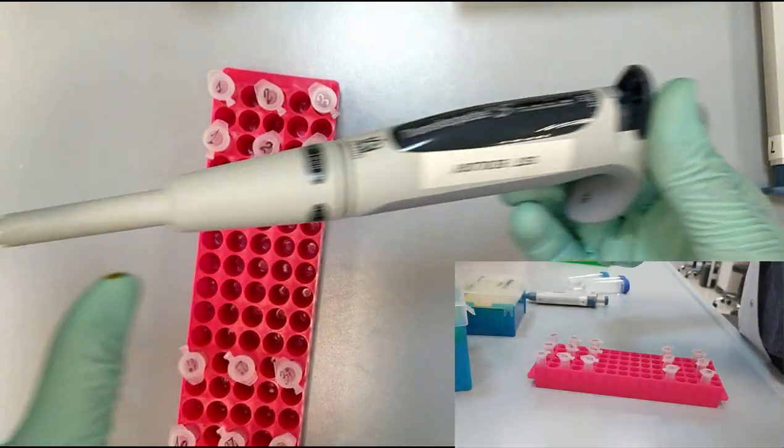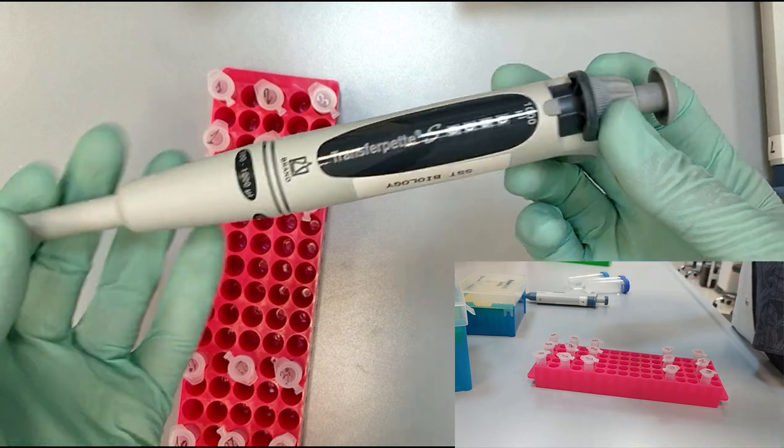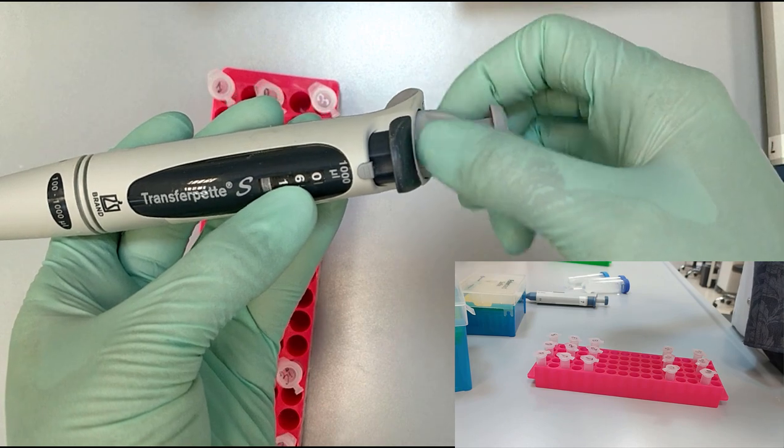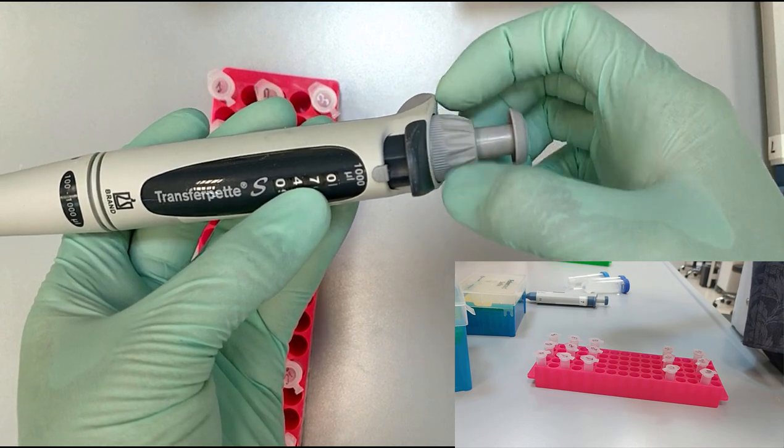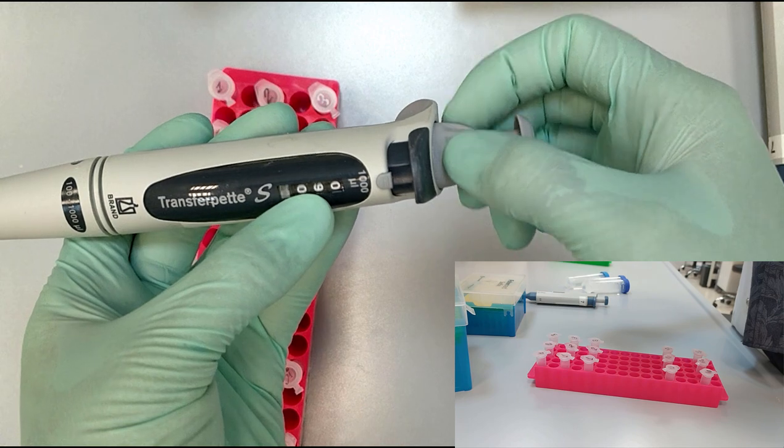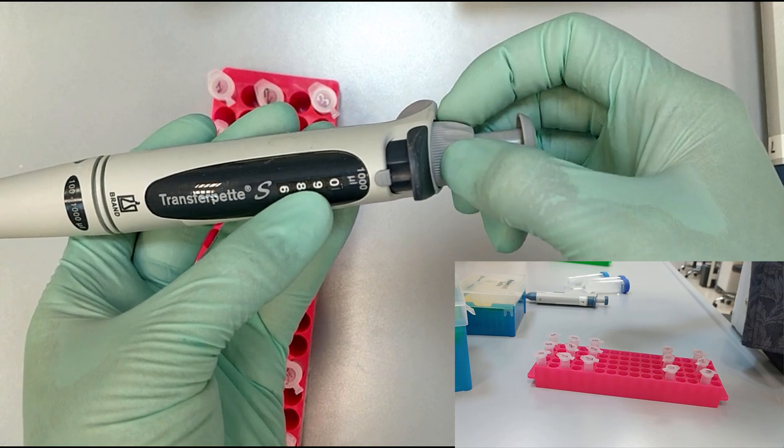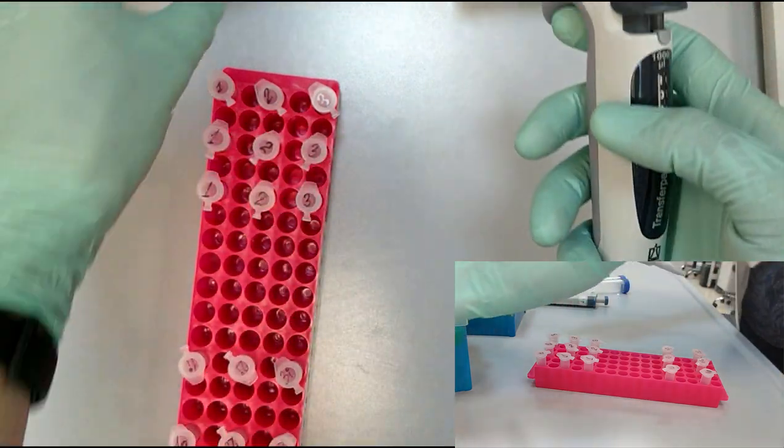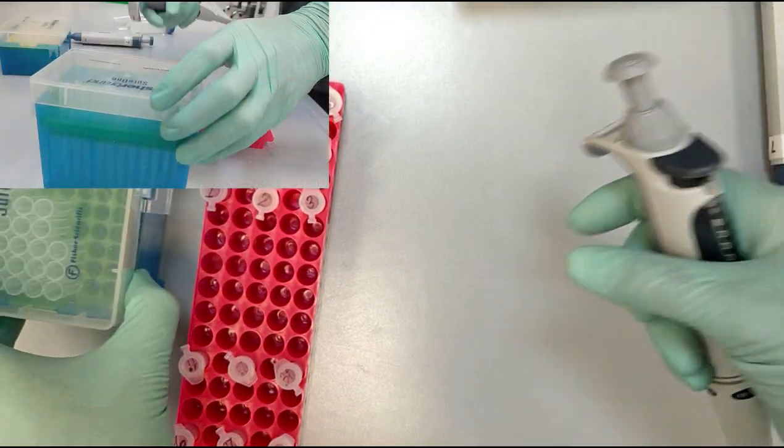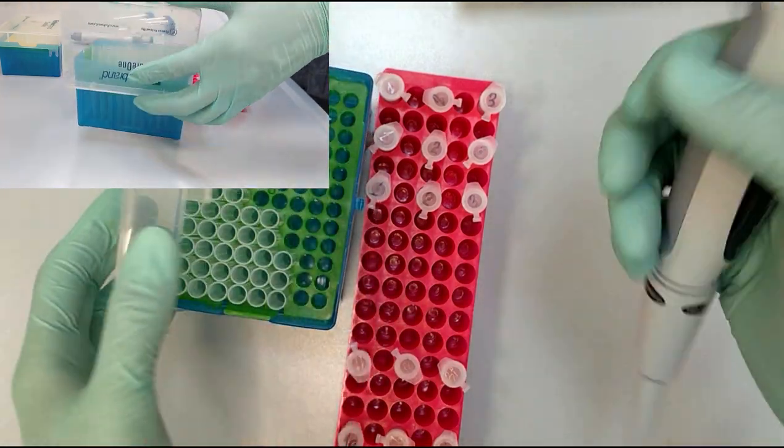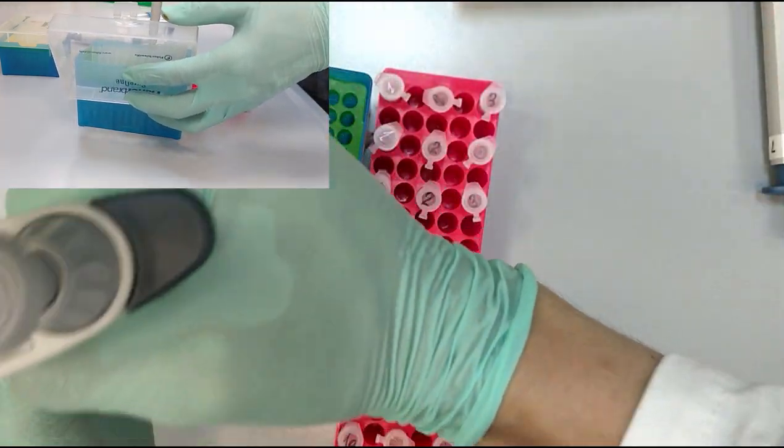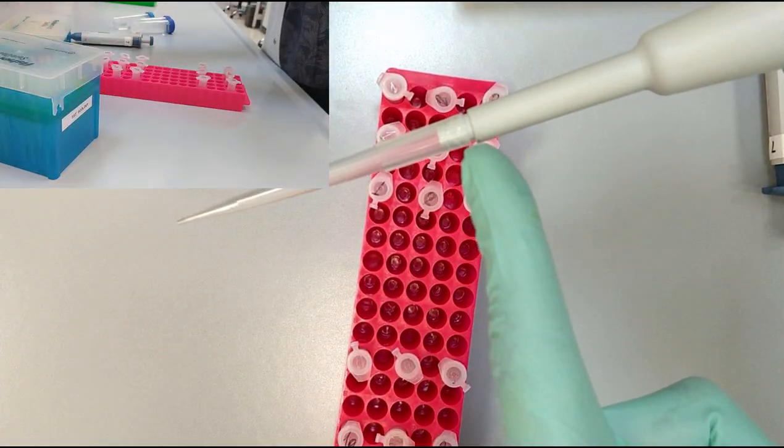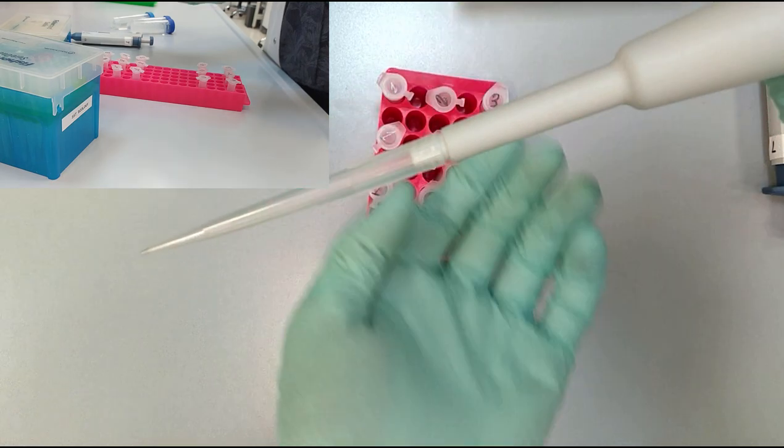We take the one milliliter pipette and set it to 1,000 microliters. We press on the tip so that it is in its place, and here you can see it.